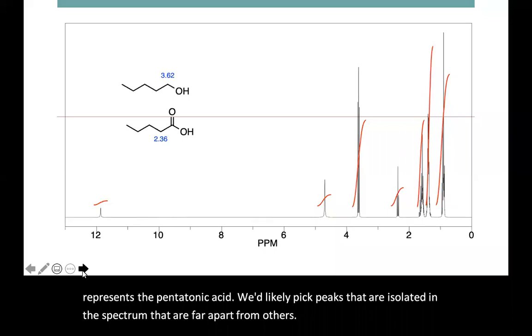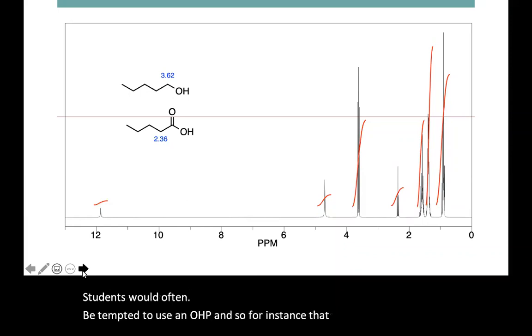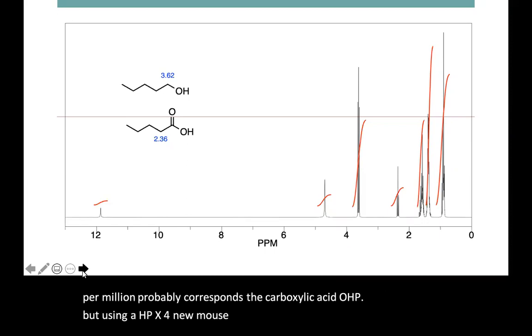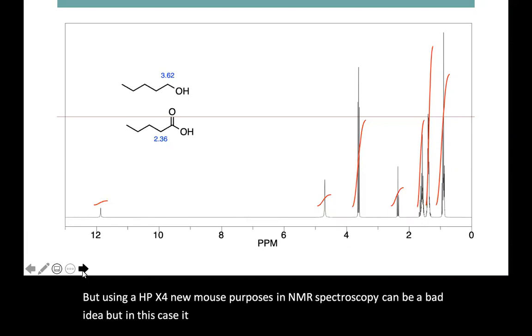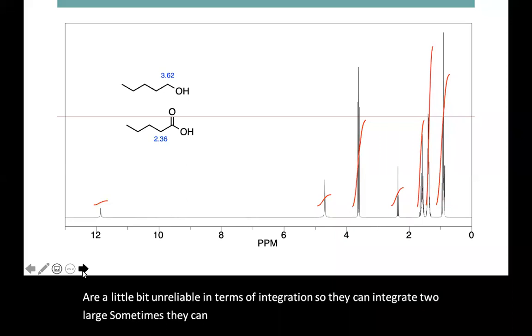Now, students would often be tempted to use an OH peak. For instance, that far left peak at 12 parts per million probably corresponds to the carboxylic acid OH peak. But using OH peaks for most purposes in NMR spectroscopy can be a bad idea, and in this case it is. OH peaks are a little bit unreliable in terms of integration — they can integrate too large sometimes, they can integrate too small other times. They're not a great tool for what we're going to do here.